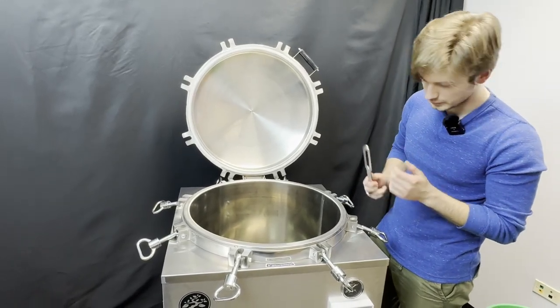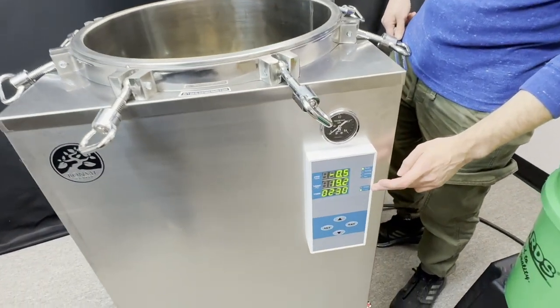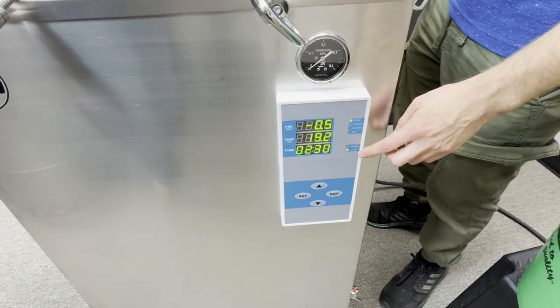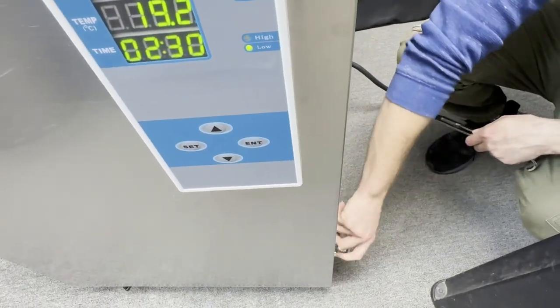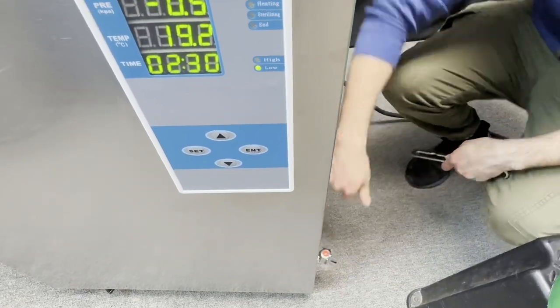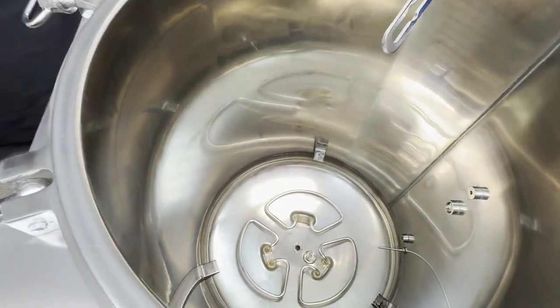Before getting our autoclave ready for our grain sterilization cycle, we want to fill it up with water. You'll first notice on the control panel there is a water level indicator showing low and high — right now it's reading low. Before filling up, make sure your drain pipe is closed by turning it clockwise.